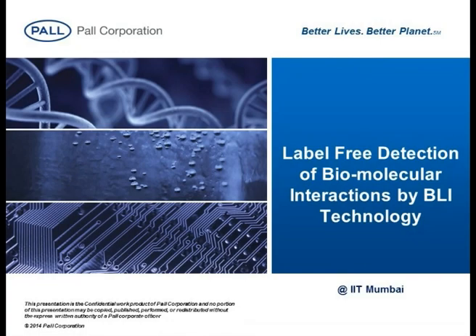As you know, there are detection systems, like in the case of protein estimations or kinetic studies, where you perform ELISAs. In ELISA, it is an endpoint detection. You are attaching a kind of tag to that.